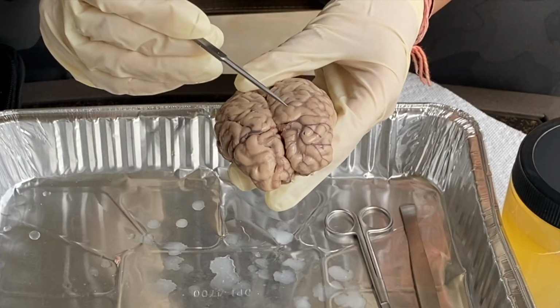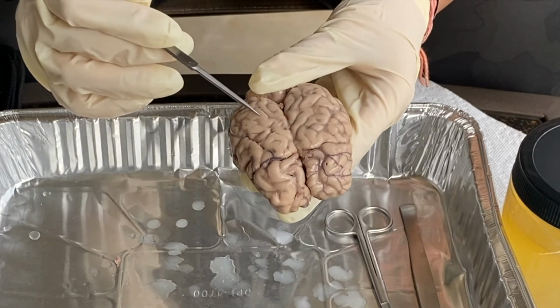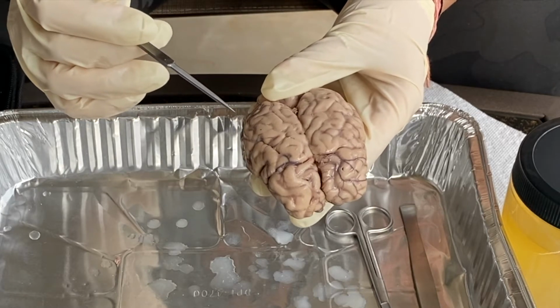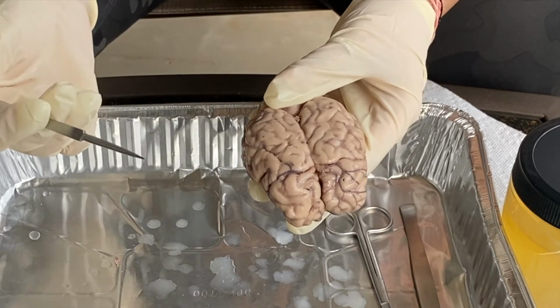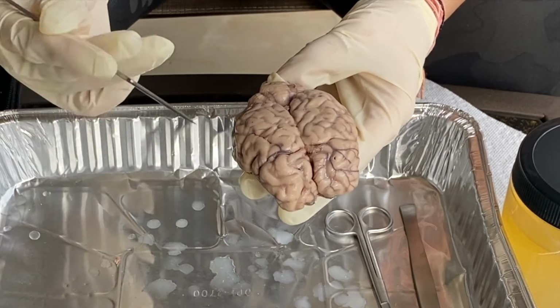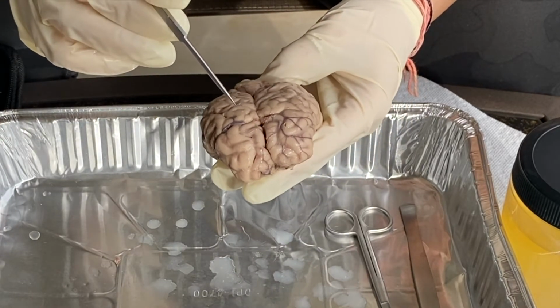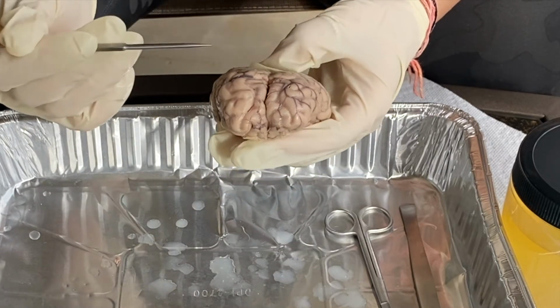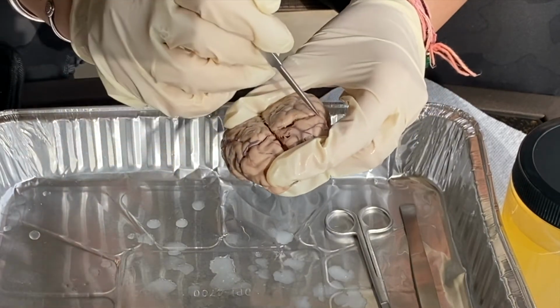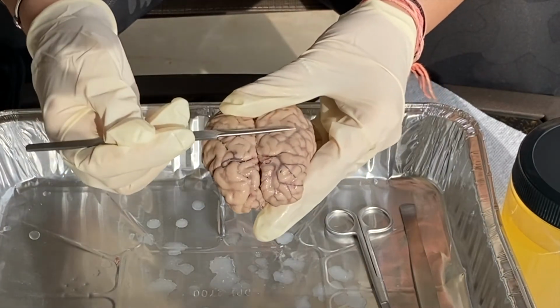So this flat part, or the top of the valleys of the brain, these ridges are known as the gyrus, and they're basically ridges on the cerebral cortex that serve to increase the surface area of the brain so that more information can be processed and stored. Then we have our sulcus, which are basically the valleys, if you take the hilltops to be the gyrus, and the central sulcus, which I believe is this one here, is what separates the frontal lobe from the parietal lobe.